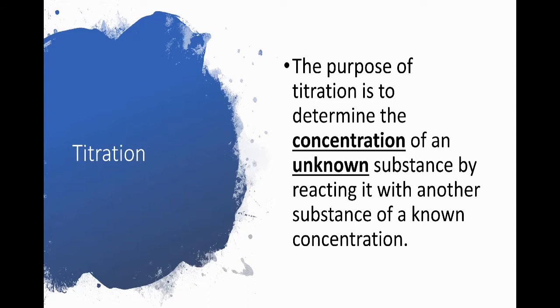So let's pretend that a chemical company has a spill, and they want to bring in someone to test and see how concentrated it is. Or for example, like us, when we store our chemicals, if a chemical has been on the shelf for a long time, we may want to test it to see if it still has the same concentration that it says on the bottle, or if that concentration has weakened over time. Essentially, we have something that is unknown in concentration, and we're going to test it to determine how concentrated it actually is, okay?